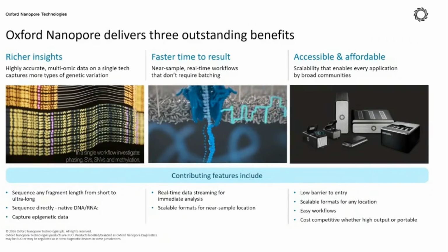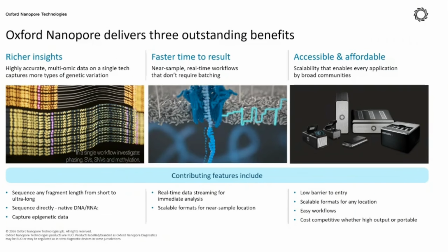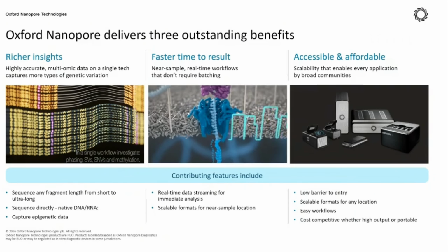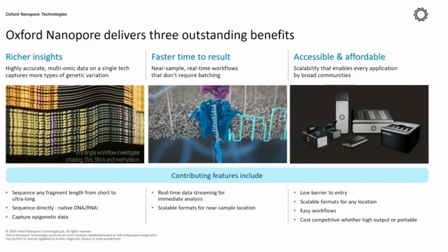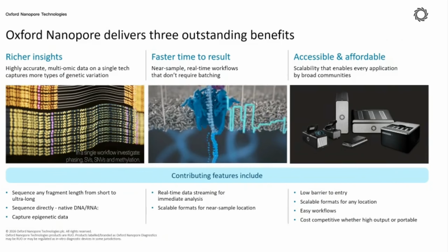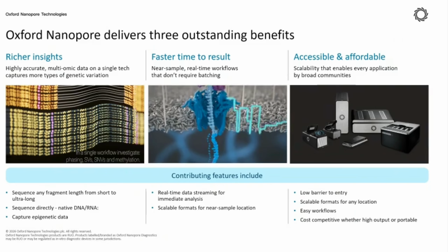Some of the bases, like cytosine, could have a methyl group attached to it, which controls the expression of the genes by protecting the molecule. After the methyl group is removed, the native DNA molecule is exposed to the transcription factors, and then gene expression can happen accordingly.